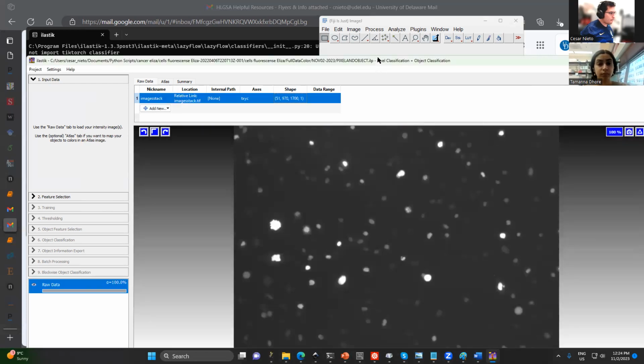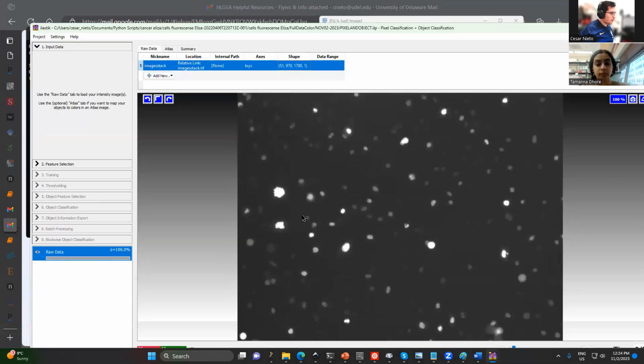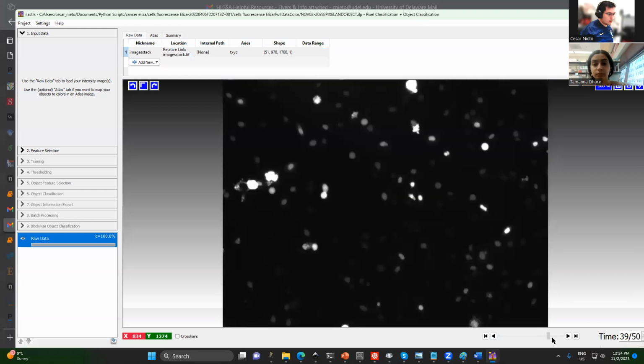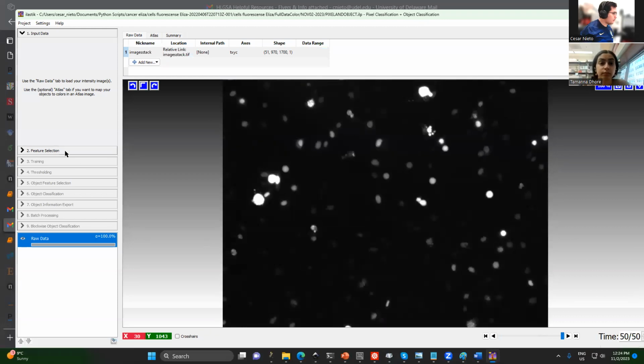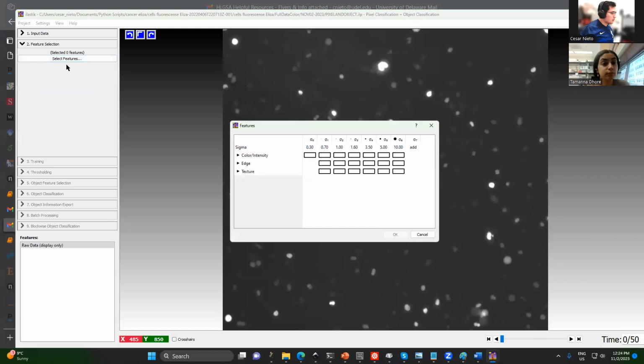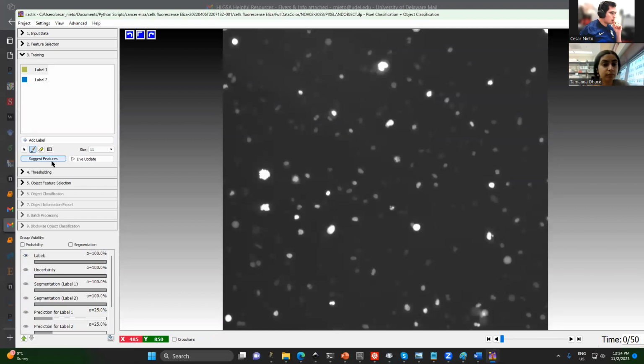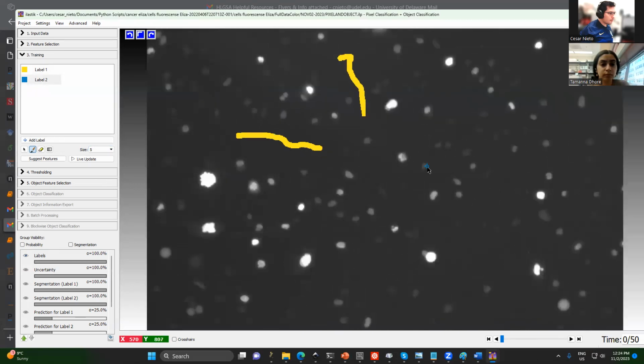Okay. Okay, seems everything is fine. So let's start with, I don't know, something that it's not very. I'm gonna make here the training.